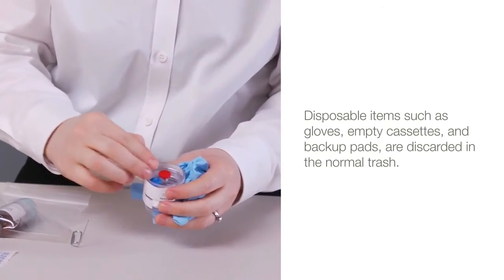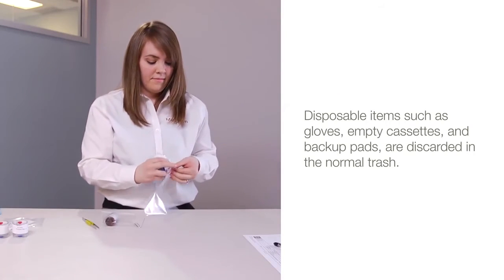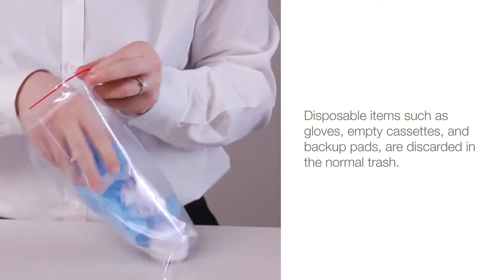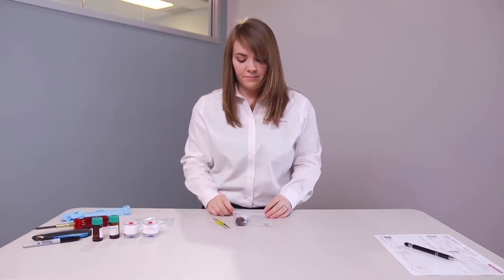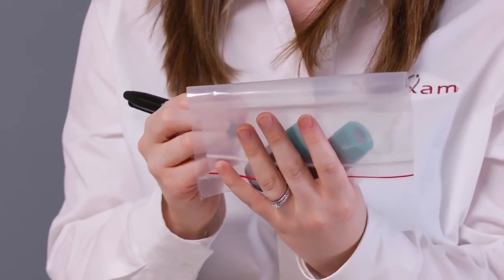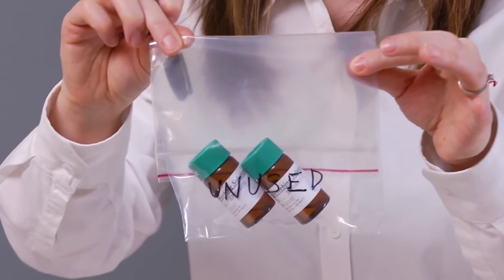Once all samples are complete, disposable items such as gloves, empty cassettes, and backup pads are discarded in the normal trash. Any extra solution vials must be disposed of according to regulations appropriate for the chemical agent. You can also return them to the laboratory clearly marked as unused.